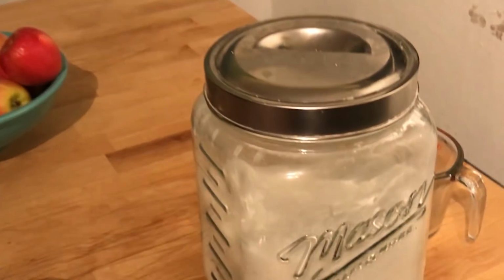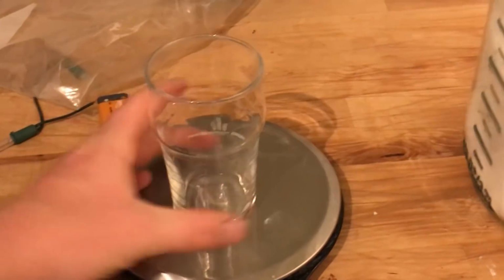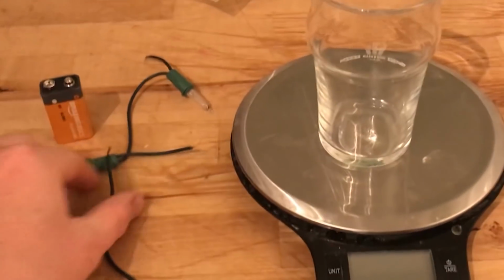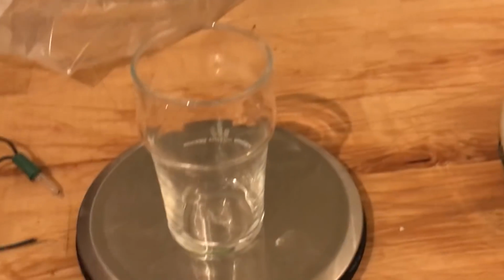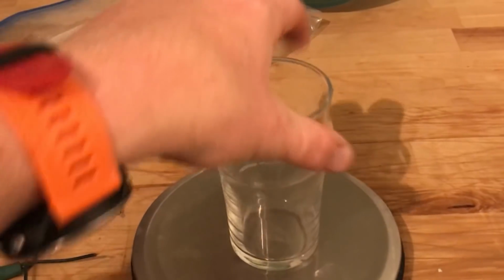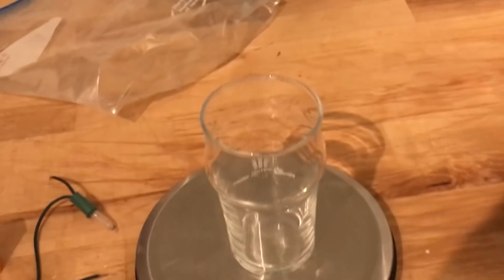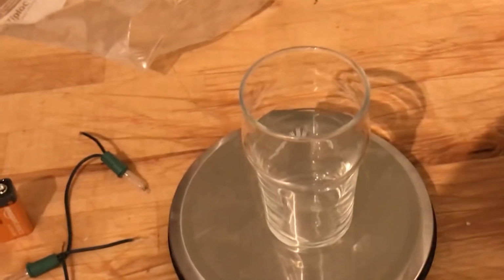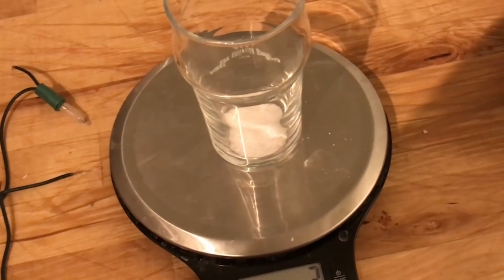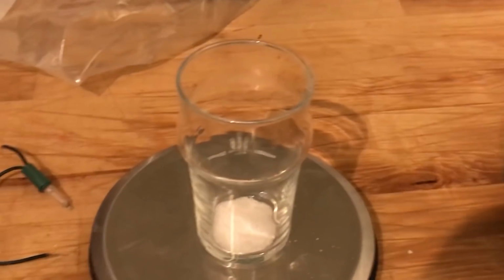In order to do this, I've got sucrose, table sugar. I've got my light apparatus, my 9-volt battery, and this extra piece of wire. What I'm going to do is get as close as I can to the appropriate solution. So I got this piece of glassware. I'm going to put it on my digital balance and tare it out at 0. I'm going to add table sugar until it registers a mass. Okay, that's 2 grams of table sugar.